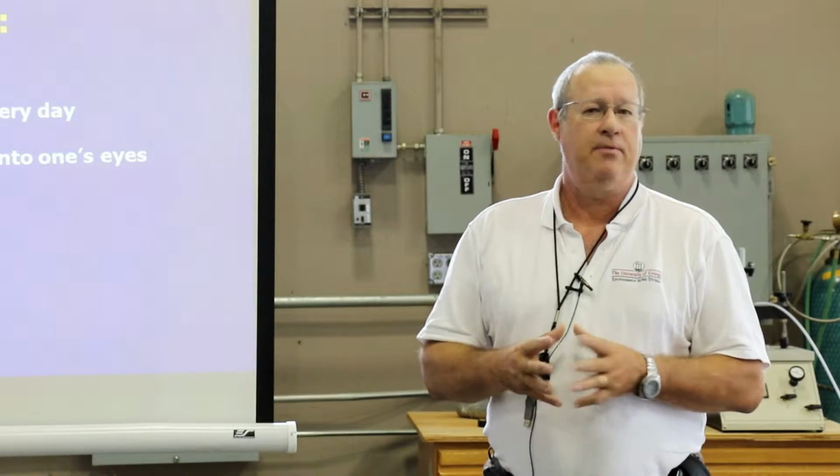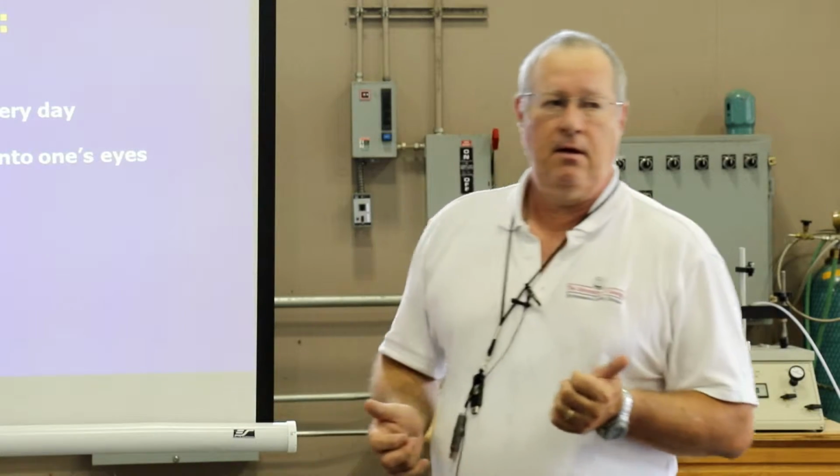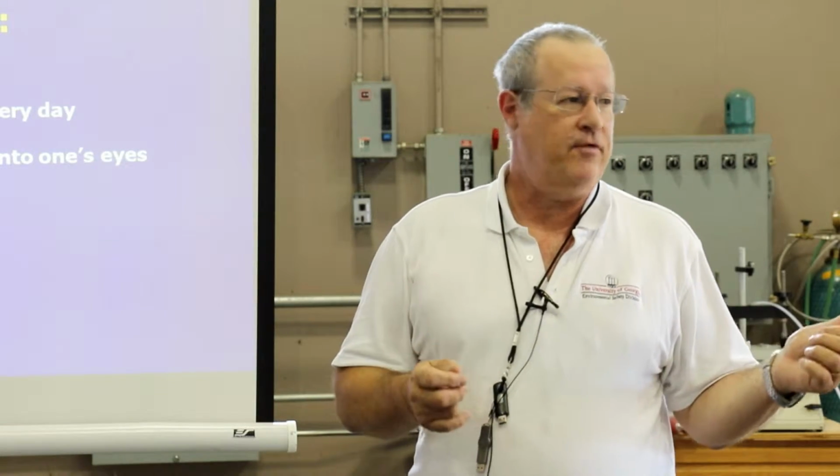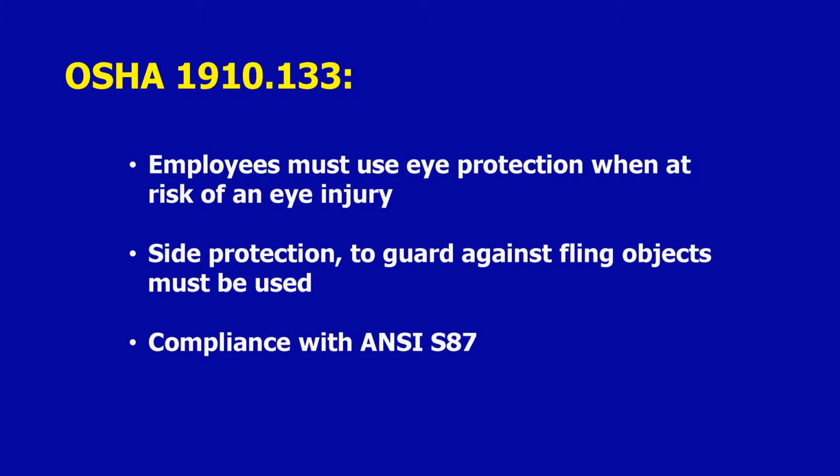Most people won't wear eye protection. Like that young lady who was handling the liquid nitrogen. The answer, oh, I'm sorry, my fault, is not the right answer.